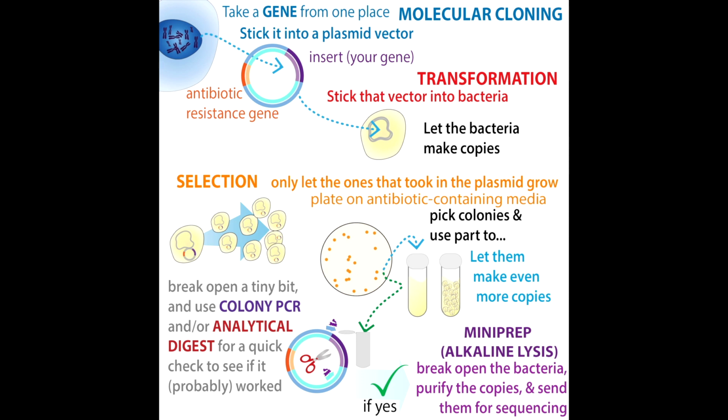So we take our bacteria that hopefully have the plasmid, and then we plate it on these plates, and we let the bacteria grow in an incubator.